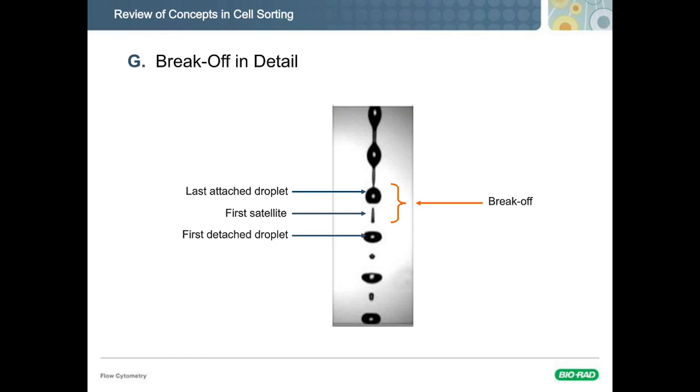So once per waveform of the drop drive period, we fire the strobe. And it's fired for a very brief period of time so that we get a nice crisp image. And by firing that at the same point every time, we're looking at one little portion of the period of each drop drive. And so that gives us a fixed image relative to the drop drive so we can see the different things that are happening with that.